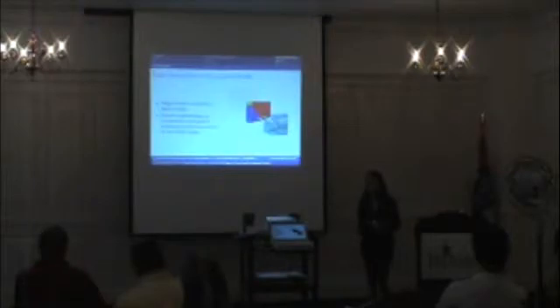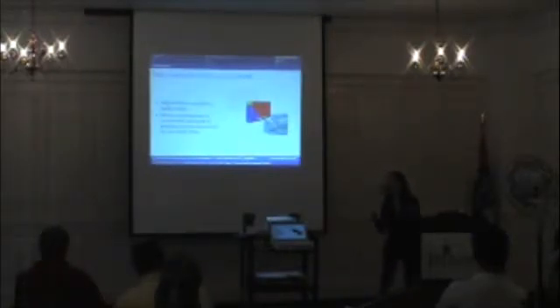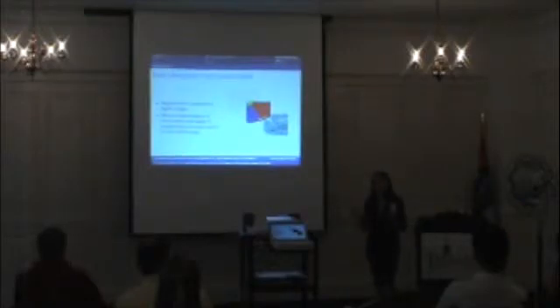Okay, so the first thing we're going to talk about is what is segmentation. A lot of you are computer scientists and maybe you're confused when we say segmentation. Segmentation is simply the process of partitioning a digital image into disjoint, non-overlapping regions. So we've got a picture of 4 cells, and we want to outline each cell in the eggshell and make sure that there's no overlapping in the pictures as well.